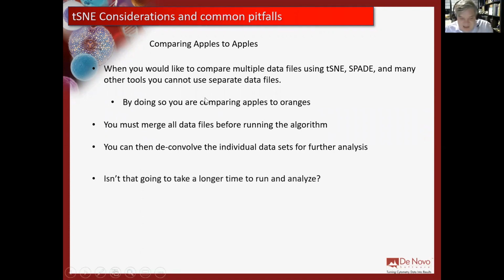So, you might say, all right, well, I've got 100 data files. They're all a million data points, right? And I've got 100 million data points. Isn't that going to take a long time to run and analyze? And the answer is yes, it is. The more data you give these things, the longer it's going to take to run. And I know it seems surprising sometimes to hear that, but that's what these labs that are doing big tSNE runs are doing, comparing 5 controls to 100 patient samples. They're merging all of that data before they actually do it.